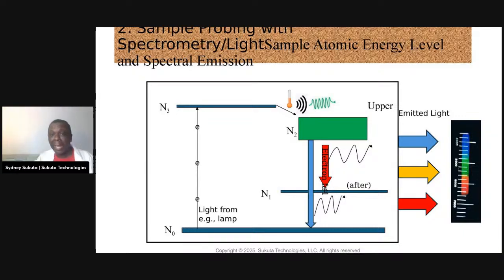Now, those gaps actually represent specific colors or wavelengths. So what you'll see outside is this rainbow here. See that? This rainbow here. In this case, you're hitting the sample, so this is the spectrum of the sample. This is in angstroms, so you can chop a 0. So this is like 400 to about 700 nanometers in the optical, in the visible spectrum. So this is the spectrum of the sample.